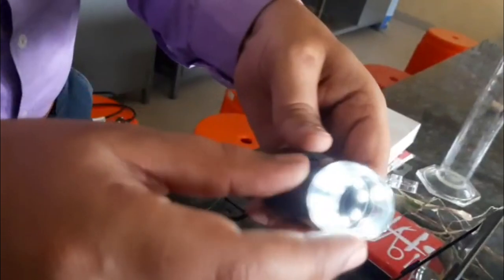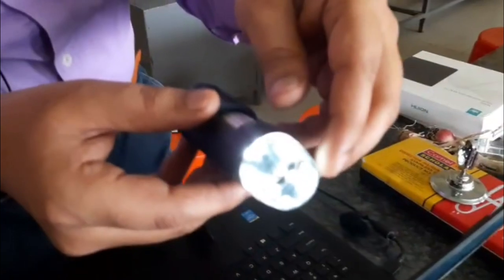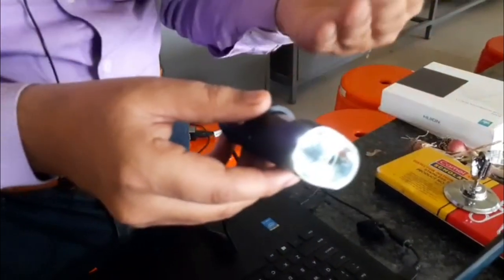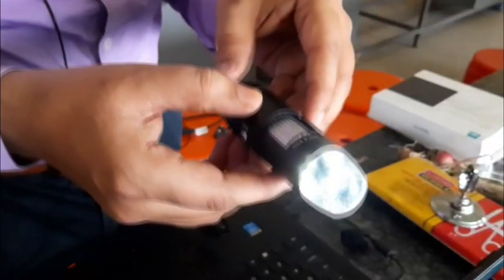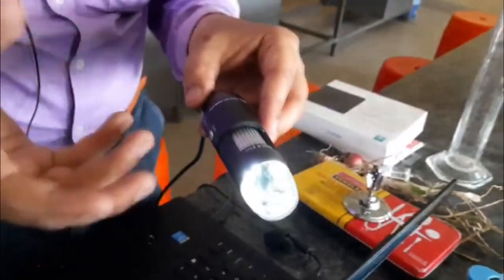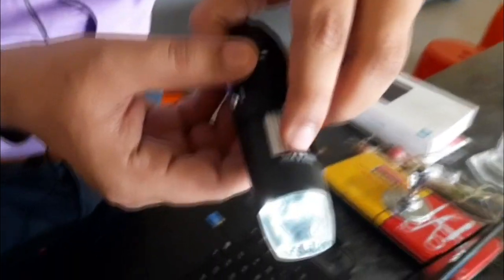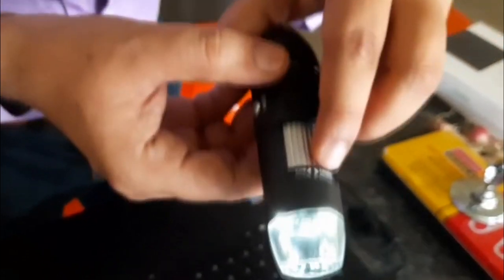First, you can see it has 80 LED lights, which allow you to record or take photographs of any object even in a dark room. The most important feature is that this digital microscope can magnify objects 50 times to 1000 times more, so it can magnify tiny objects that cannot be seen with the naked eye.